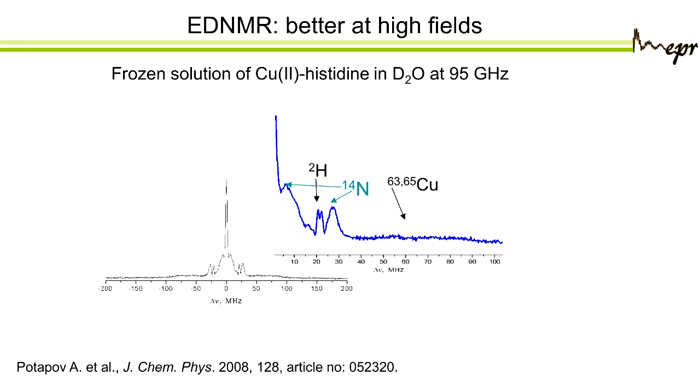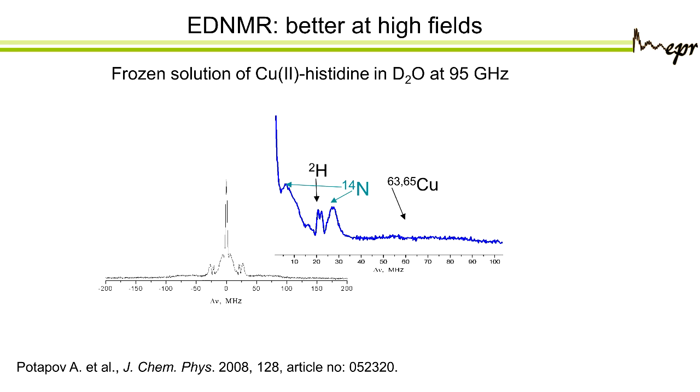Okay? So now at 0, you will have the two of them overlapping. So this is just giving a huge long pulse on this transition, which basically saturates it. So at 0, you get a big hole. Right? So you see the hole in the middle, right? So now this spectrum has been inverted. So instead of being negative, it's positive, but this was just done by multiplying by -1, so it helps to see. So at 0, you see a very sharp line.